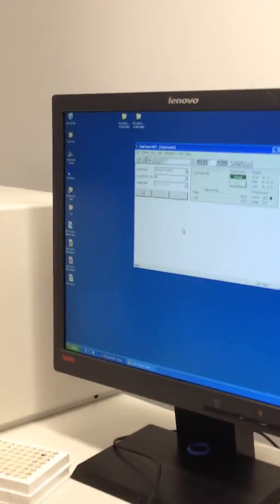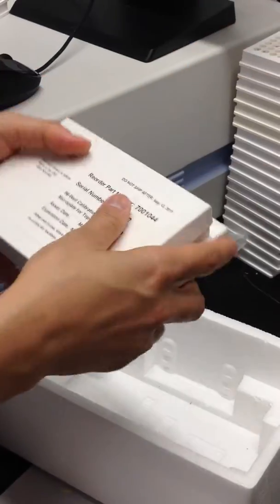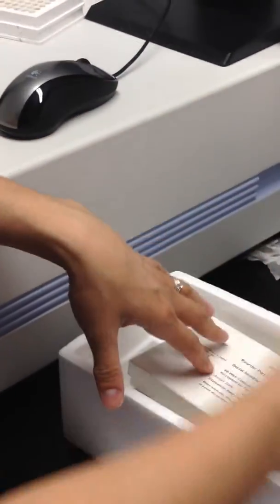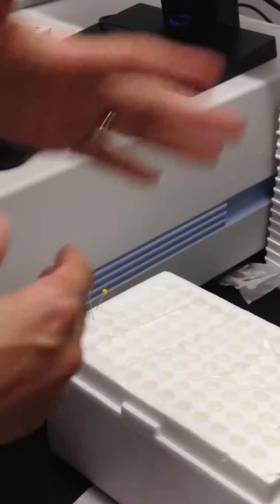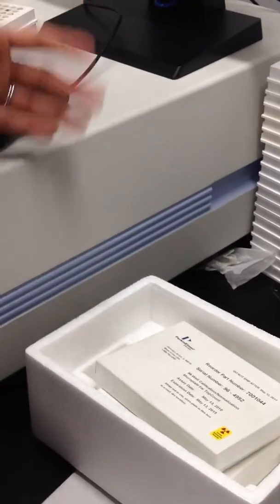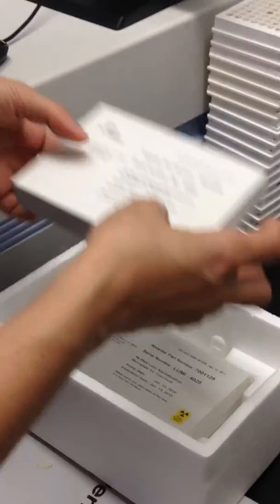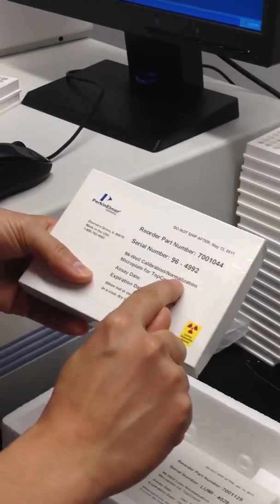Okay? And what we use in order to do that is a specific calibration plate. Those are the plates here. They're radioactive, but the radioactivity is so small that they're not hazardous. It's very important though that they stay in this box sealed like this so that if the university personnel walk into the chamber and see radioactive plates, they don't freak out because they don't realize that those are not hazardous. The calibration plate that we use says on it calibration normalization.